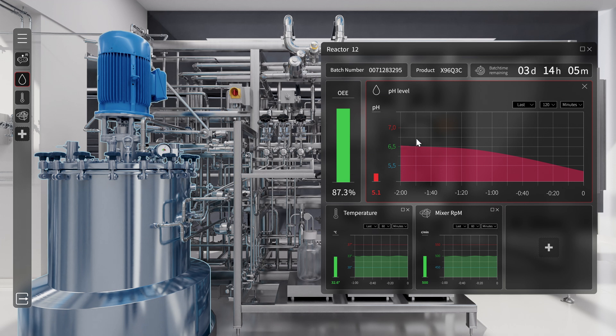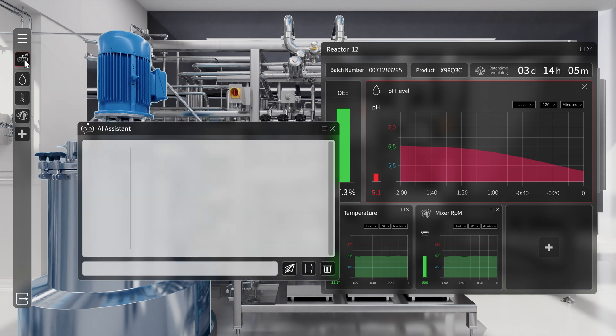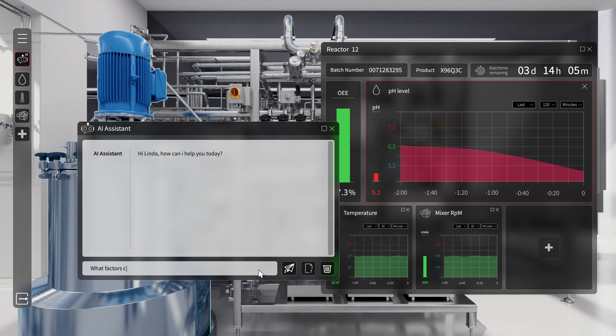A quick check of the dashboard reveals that the pH level has dropped below the threshold. But what caused it? Linda turns to the integrated AI assistant and asks, what factors could be affecting the pH level?